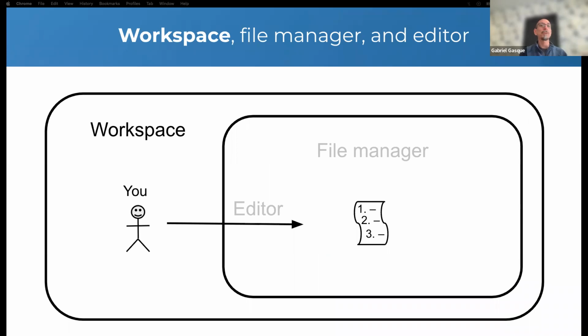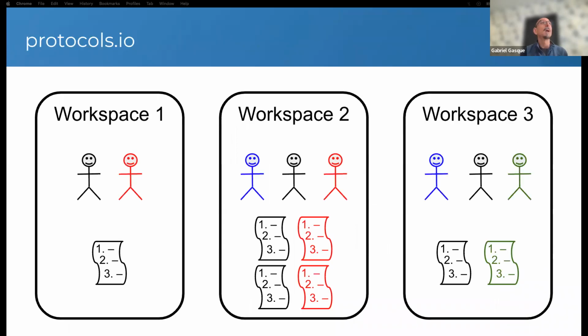Now, going back to the workspace, you can create multiple workspaces in your account, depending on your research and teaching needs. You can create workspaces for different research projects or to teach different classes or lectures. Each workspace can have different members and contain different protocols and documents, giving you great flexibility for organization.